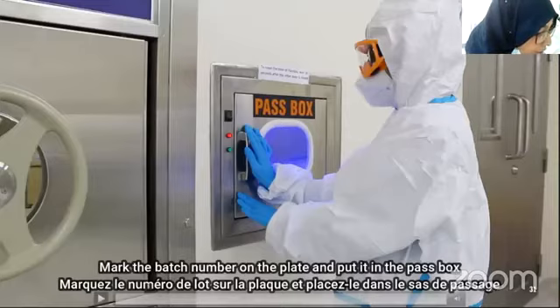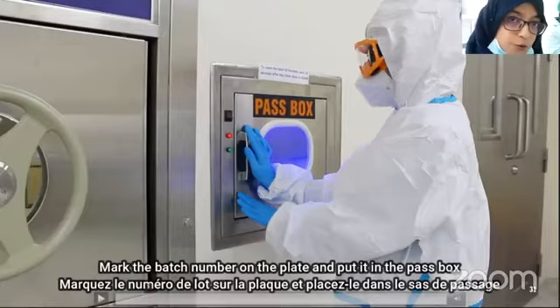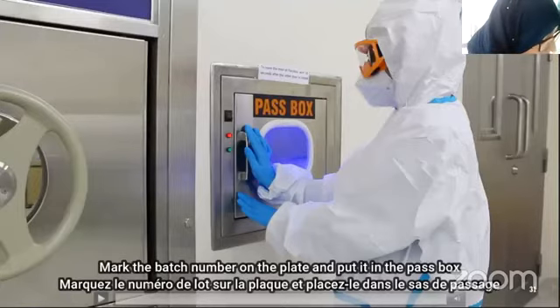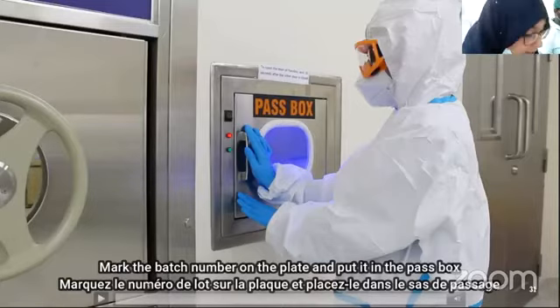And the next question is how much ethanol was used to concentrate, and which concentration? So we are adding 560 microliter of ethanol into the sample, and we are using the absolute molecular grade ethanol. Kindly explain the extraction negative control. Basically, we are using the RNase, DNase free water, which is also provided with the kit.